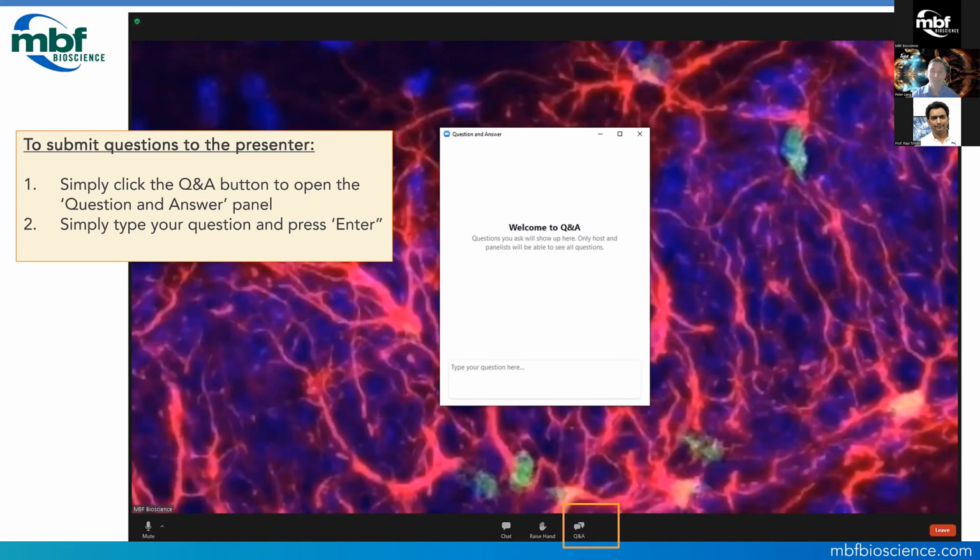So in general, if the clearing has worked out well, then you can go as deep as your working distance allows, right? So we have imaged 6, 7, 8 millimeter deep. It can maintain the quality, especially with this adaptive parameter correction strategy, which could take care of the loss in the properties.